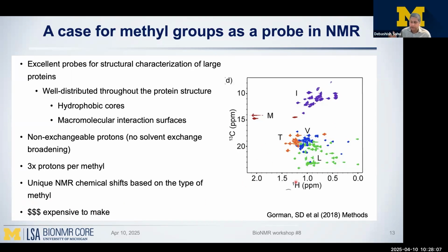So again, I'll show you what materials are required, and I have a protocol that I can share with you when you want to make such a sample. Again, it's not difficult, and people have done it at large scale. People have automated it. I'll show you some examples of how that is done. And basically, please note that it's going to be expensive.